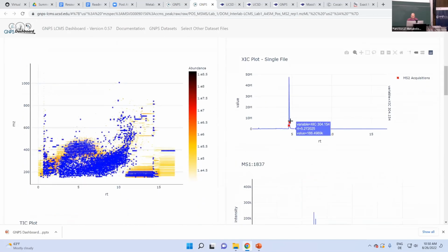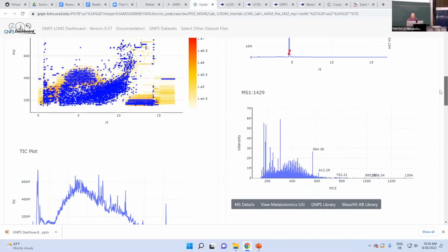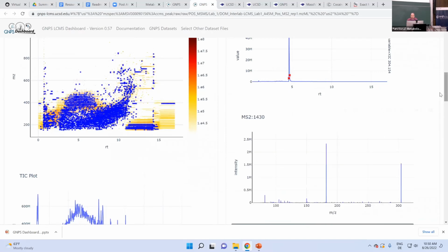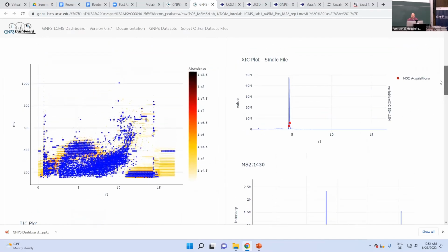And then I want to also display the MSMS as the characteristic for this compound. So now I can make a screenshot of it, and that would not give me a vector graphic. So that might not be what I want to do.